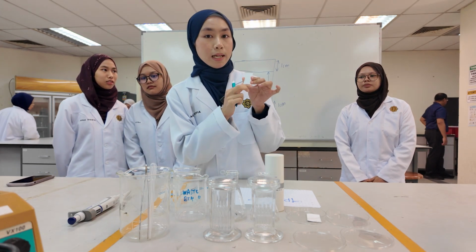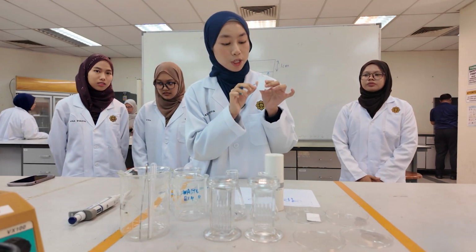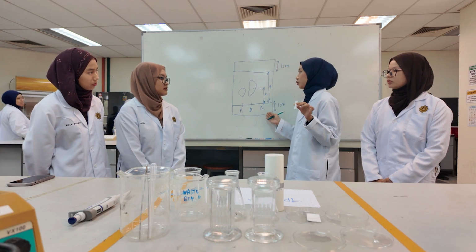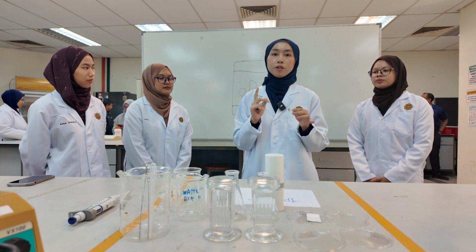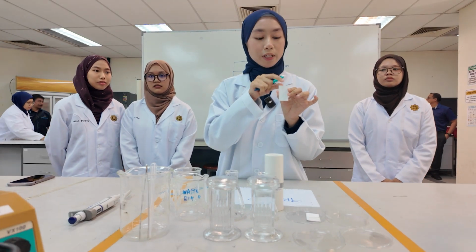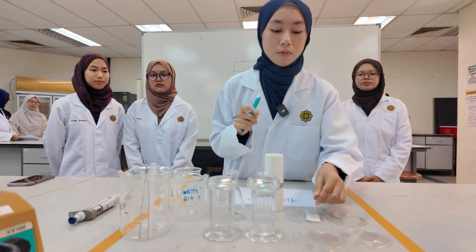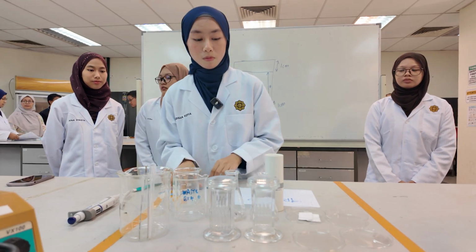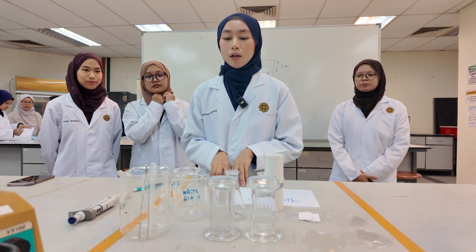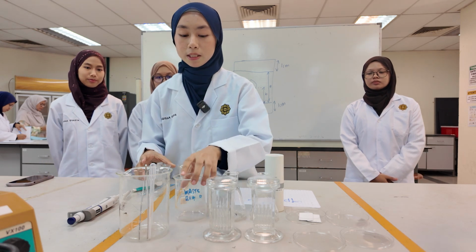Also, along the baseline, label the spots for each sample, which are acid, base, and neutral. Also, don't forget to label the developing solvent that will be used. Now we prepare our sample solution in 3 separate beakers.